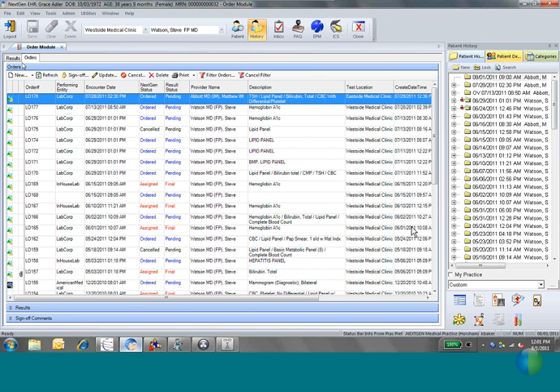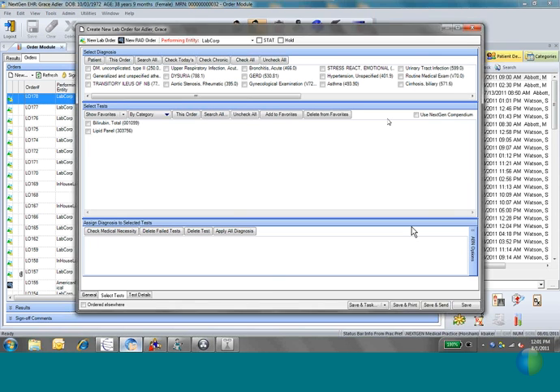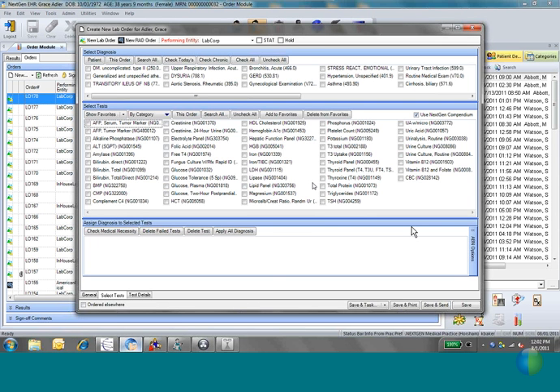I'll do it on a new one real quick. So here's a bigger list. So you can do as many tests as you want. It'll create a checkbox for each one, and it'll automatically do a scroll bar if you need to as well. So you can have as many tests as you want.